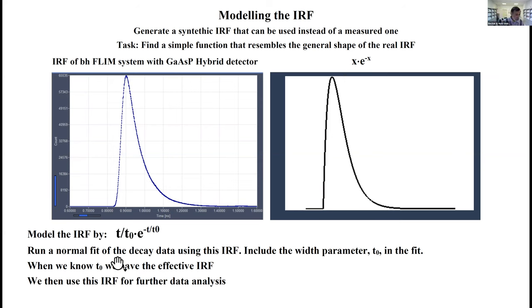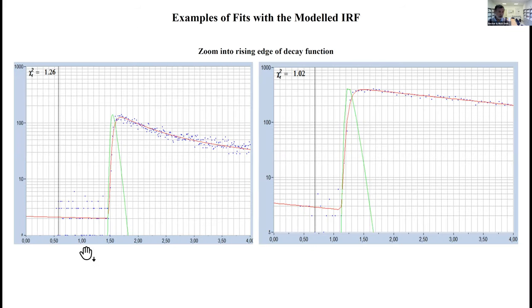The recipe is now we run a normal fit of our decay data using this IRF, but we include the parameter t0 in the fit. What we then get is a parameter t0 which gives the optimal fit for our selected model function. When we know t0, we have our instrument response function. We have a mathematical expression of it, and we can use this IRF for further data analysis. This works surprisingly well.